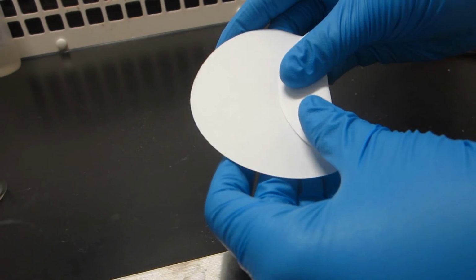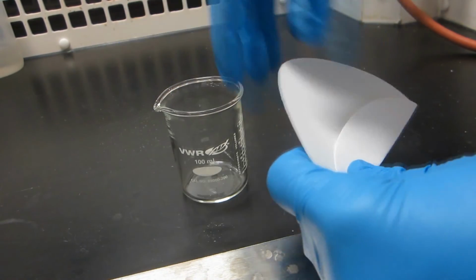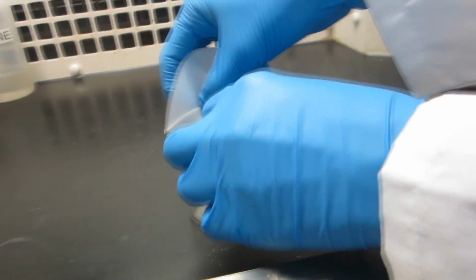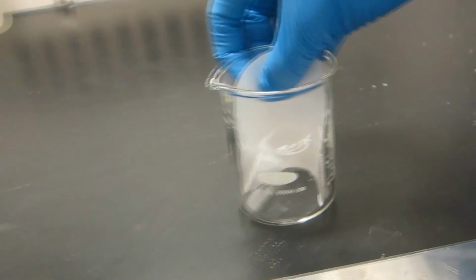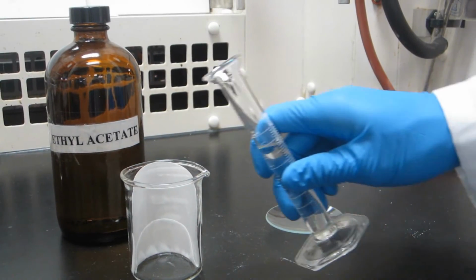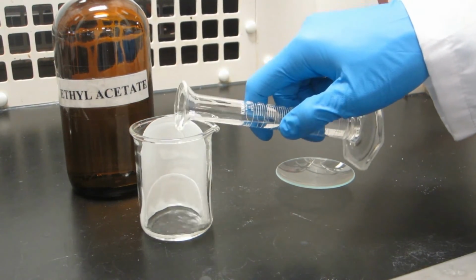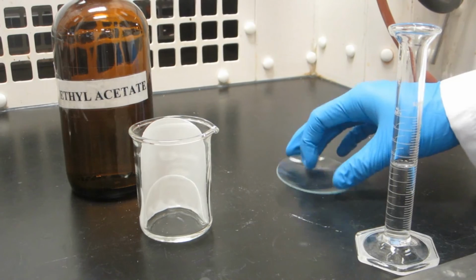The developing chamber is prepared by pouring a small volume of solvent into a beaker or jar lined with a folded piece of filter paper. The solvent level should be about half a centimeter deep. Too much solvent will cause the samples to dissolve before getting a chance to elute. Cover the developing chamber with a watch glass.